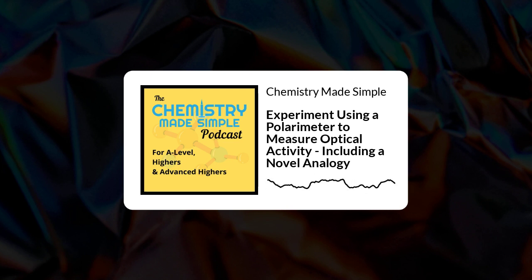And the observer will turn another polarizing filter to see at what angle the plane of the light is coming to the observer. And comparing that angle to the starting plane, we can see whether or not the plane of the light has been turned and whether or not, therefore, the sample is an optically active sample, an enantiomer, an optical isomer. Okay, so let's think about this analogy.